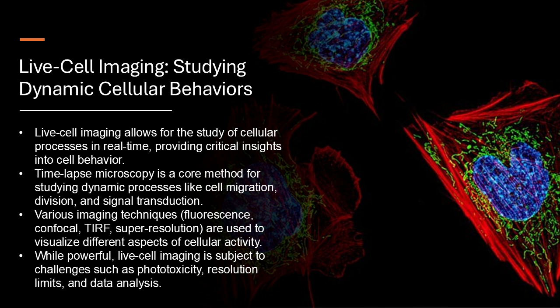Another fascinating one is called TIRF microscopy. It stands for Total Internal Reflection Fluorescence Microscopy. That's a mouthful, but it's a really neat technique. It lets us focus specifically on events that are happening at the cell surface, like watching molecules interact right at the boundary between the cell and its environment. So like observing the cell's skin up close and personal. That's right. Fascinating. It seems like there's no limit to how closely we can observe these tiny cellular worlds.